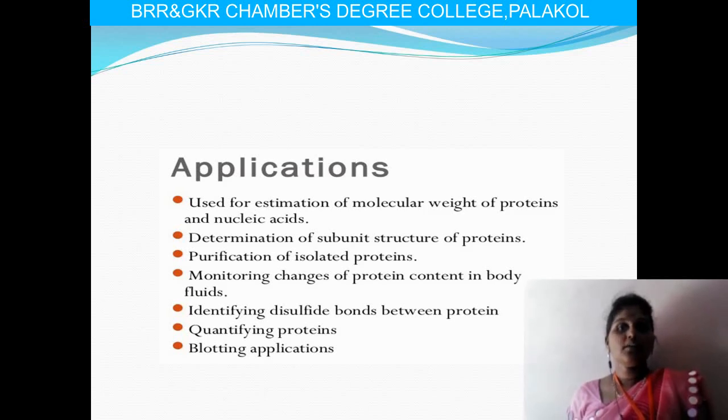And in the body we can have many proteins. Those proteins have to be monitored by using this technique. We have different types of proteins like globular proteins. These globular proteins can also be observed or monitored by this electrophoresis, and it is also used for the bonds present between proteins, that is, disulfide bonds, which can be estimated or identified by using this electrophoresis.